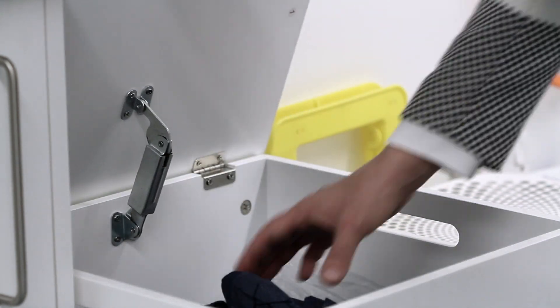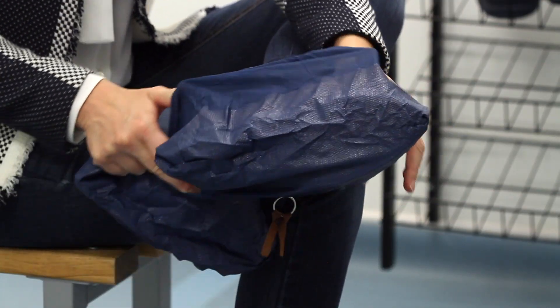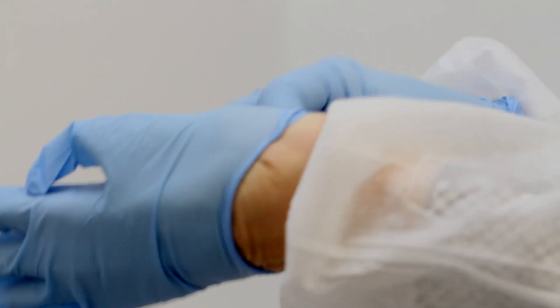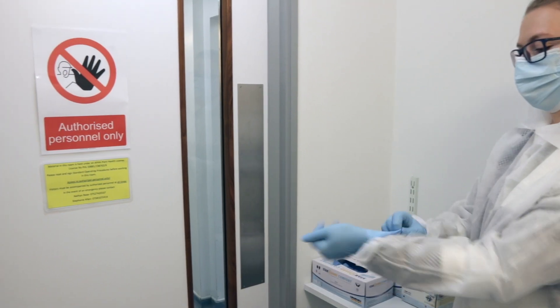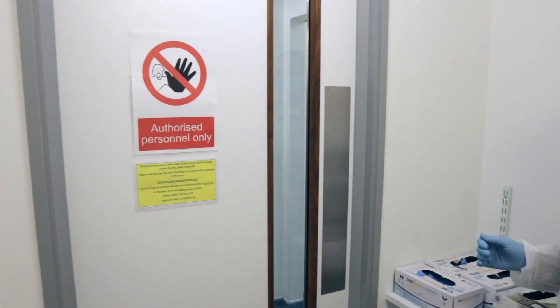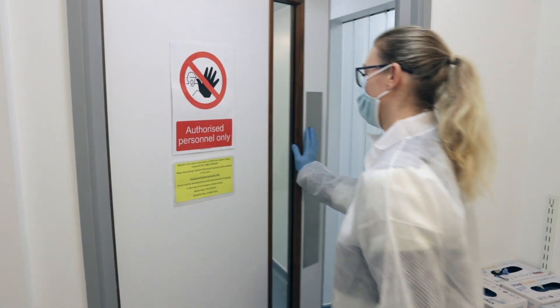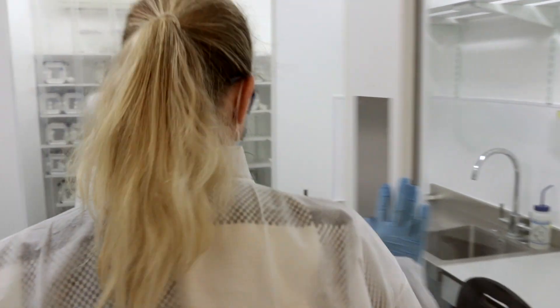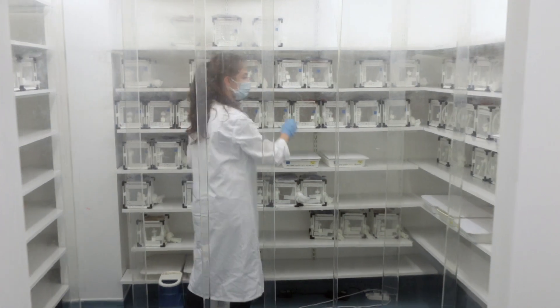Strict access control is implemented for all areas. Wearing lab coats, lab shoes, and gloves is imperative. Once these measures have been followed and you enter through different sets of closed doors, you will be immediately struck by the change of temperature. Far from the chilly England weather, you will find conditions perfect for a mosquito.